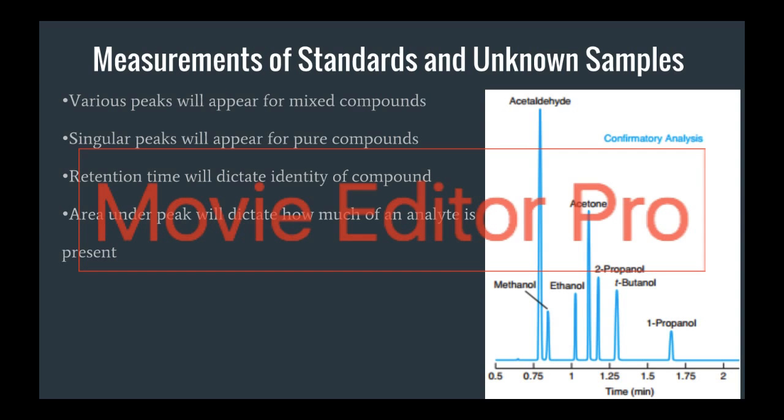Various peaks will appear for mixed compounds. Singular peaks will appear for pure compounds. Retention time will dictate the identity of a compound. Area under peak will dictate how much of an analyte is present.